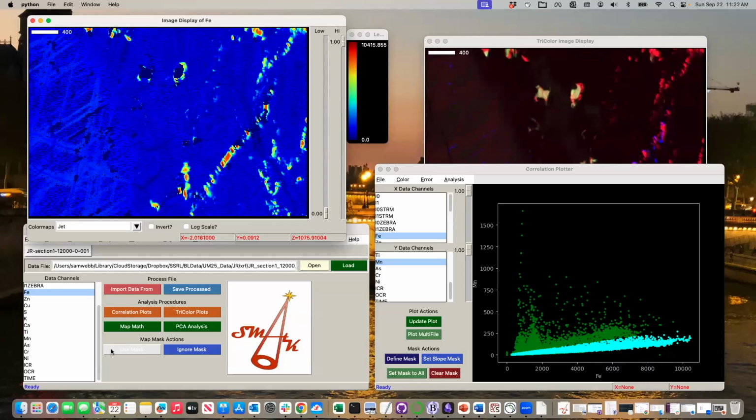It's nice to have these masks, and quite often, particularly if you're drawing them or you're particular with them, it's hard to reproduce because if you close SMAK, you may lose what you've been doing. I don't have a full session manager in SMAK at the moment. I'm being convinced otherwise slowly. But say you want to come back to this for posterity later on.